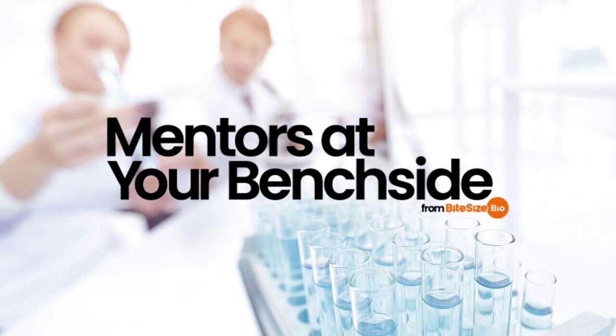After elution, DNA can remain on columns. To capture any remaining DNA, perform a second elution into a separate collection tube. Using elution buffer heated to 50 degrees C can also help increase elution yield.